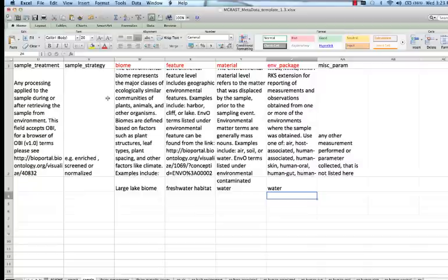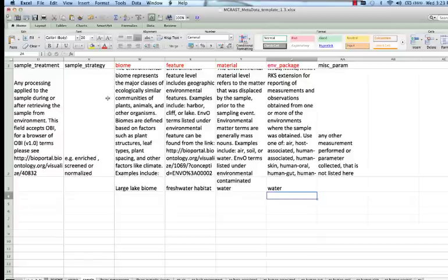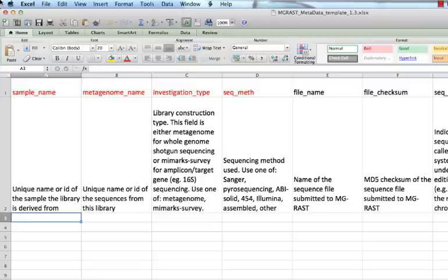Next, you will use one of the two library sheets to provide technical information for your sequencing run or runs. Use the Library Metagenome sheet for shotgun sequencing and the Library MiMarks Survey sheet for amplicon sequencing. The required fields are identical in both versions of the Library sheet. We will look at the Library MiMarks Survey sheet.